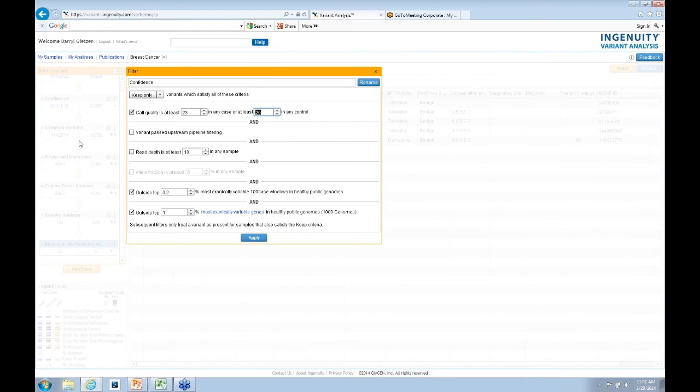Whenever things occur sequentially in the filter, they're going to be ANDed together. So in that case, you would end up with 50 in each. But to be honest, without working it out, I can't say for 100% certainty. But that would be my guess. If it's not ANDing it already, I know it says or there, then I'd run two filters, two subsequent filters in a row, and see if that doesn't fix the problem.